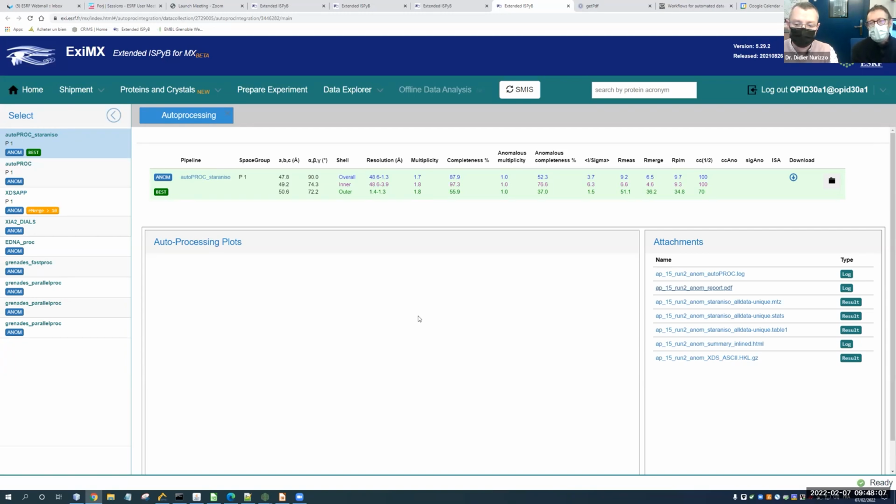But when you start to have between 2 and less than 1.5, it's starting to be a bit tricky for the strategy to be calculated properly. So basically, if we are talking of plus or minus 0.2, it doesn't matter.